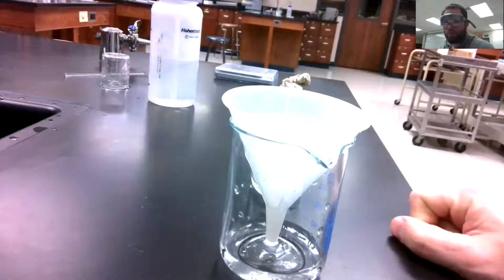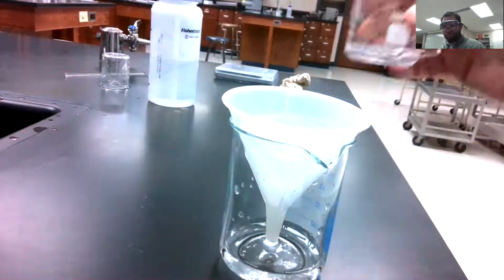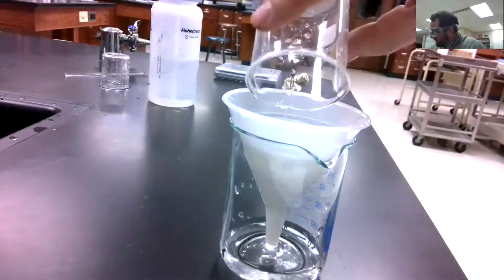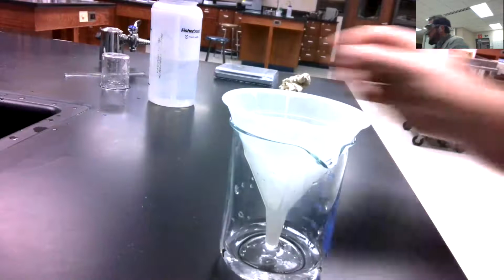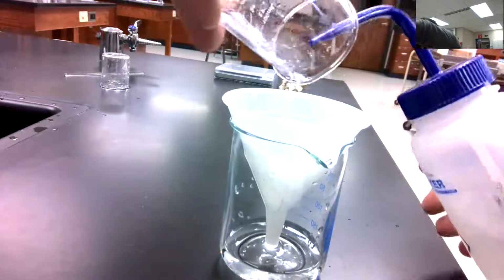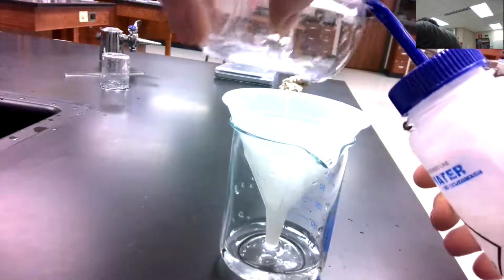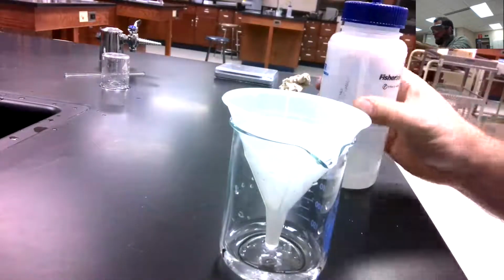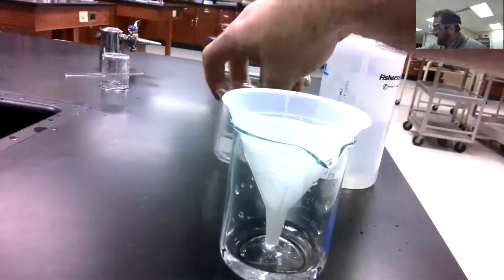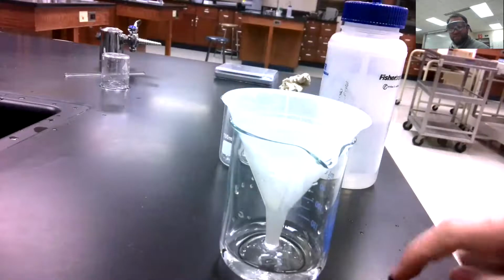And I think we're ready for our final pour here. I hope that's our final pour. Oh boy, just a slight bit less. I'll give our beaker one last little rinse here. I think we got it. Looks pretty clear. Looks like we got most of it. So now it's just kind of a waiting game. Let this funnel through.